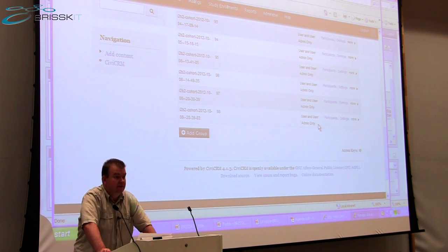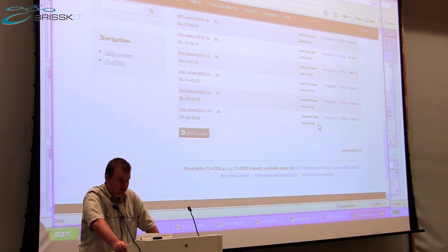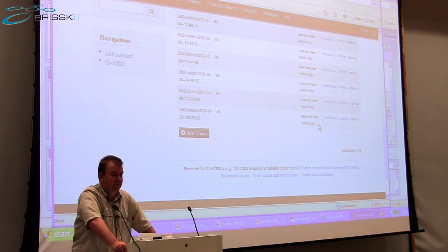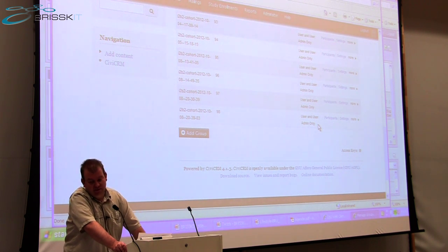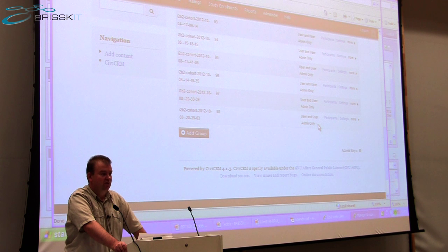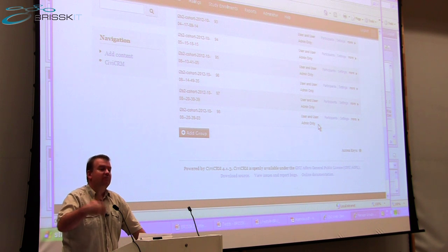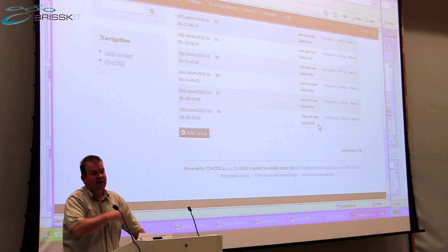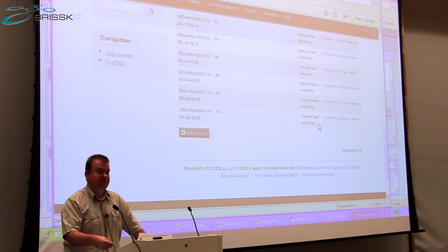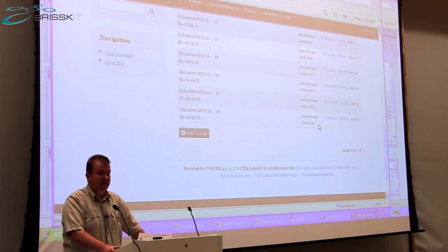Yeah, Adrian. To do that with particularly cohorts built from previous studies, you have to build that into the consenting process. Yeah. So the consent levels that we model here involve not only... I'll explain it on the way. It was about to be able to recontact people, you have to explicitly have consent to recontact, not just to carry out an initial study.